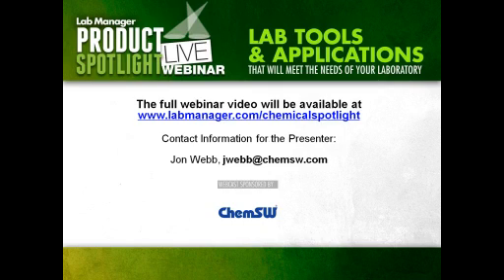Sure. Okay, what are your recommendations when you have a large open space lab that is shared by multiple PIs who order and receive chemicals individually? How do you track chemicals in that scenario? It boils down to what I was saying: the people, policies, and procedures. And sometimes it's painful, but it's going to be an organizational change.